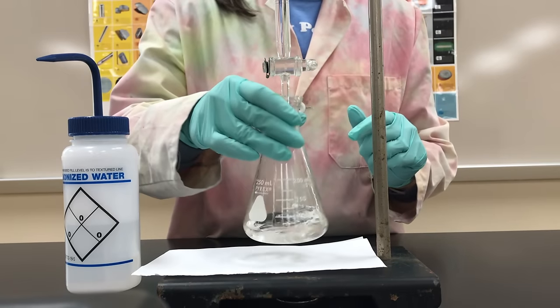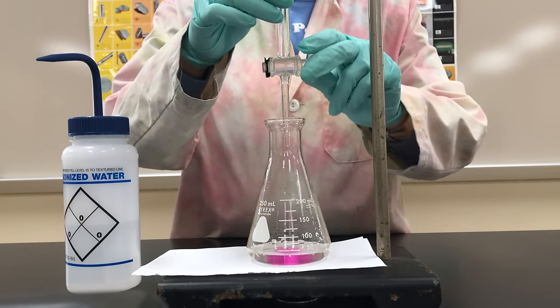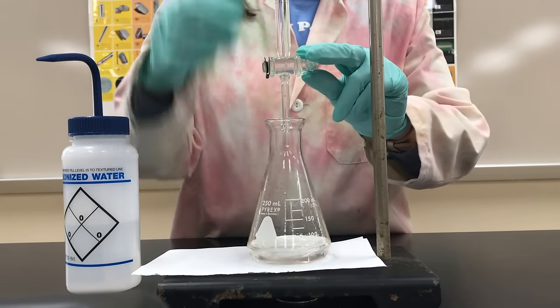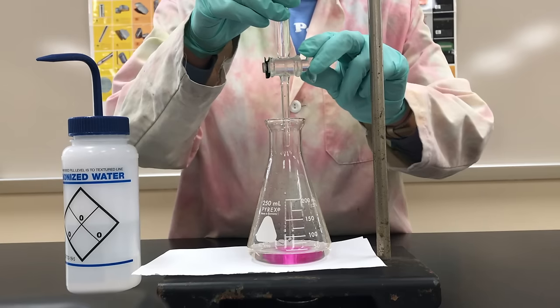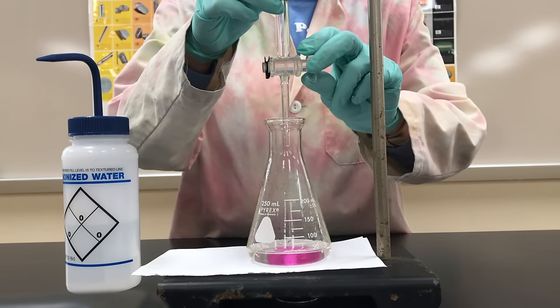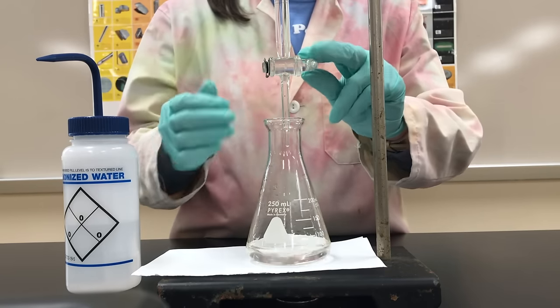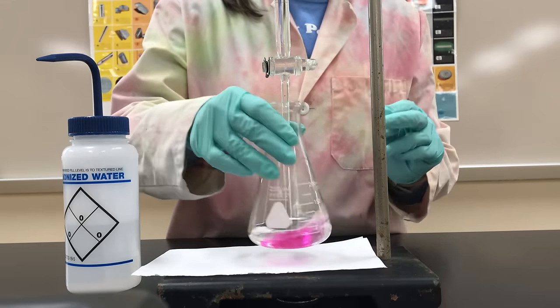If you're going to do your first titration slowly, you won't want to go too quickly, because you won't know where the end point is the first time. So add a little bit and swirl it. If you have a lab partner, your lab partner can swirl the Erlenmeyer flask while you are adding the base, or in this case, the titrant. Continue this process until you start to see that pink color, in this case with vinegar and phenolphthalein as your indicator, persist for a little bit longer. Once you start to see that pink color persist, you'll want to slow down.